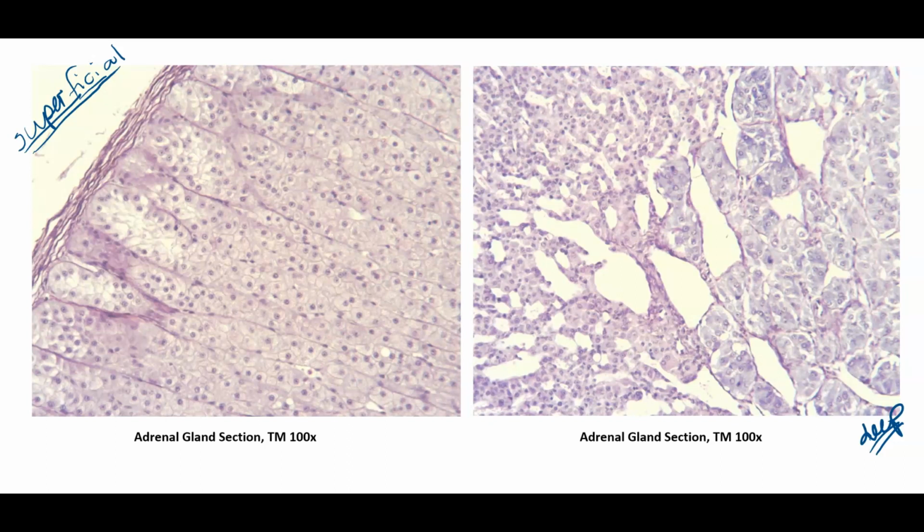So this outer connective tissue covering is the capsule, as in it encapsulates the organ, helps to keep the cells together, protect this organ from abrasion. It sits on top of the kidneys, so there are plenty of other organs around it, including the organs of digestion. Deep to that is the zona glomerulosa.